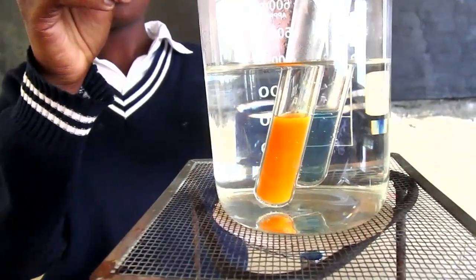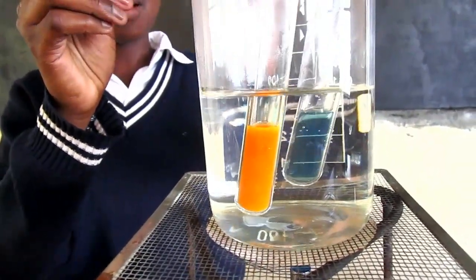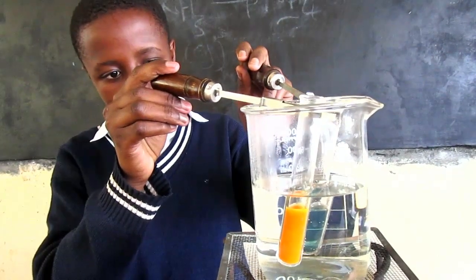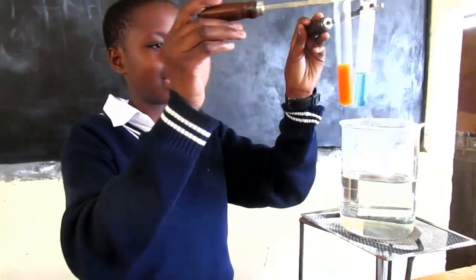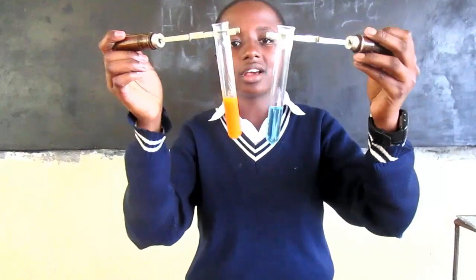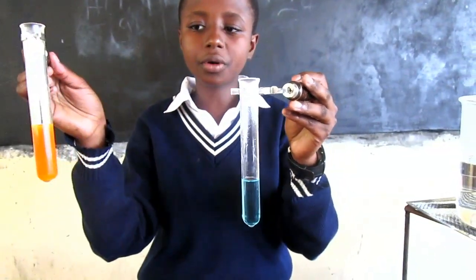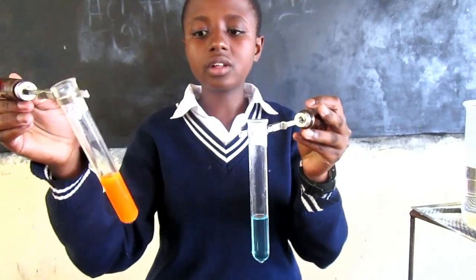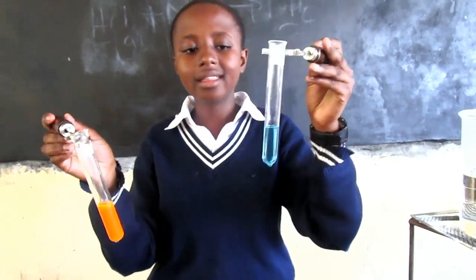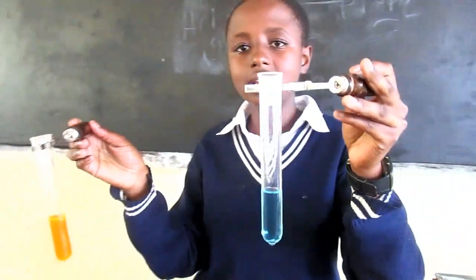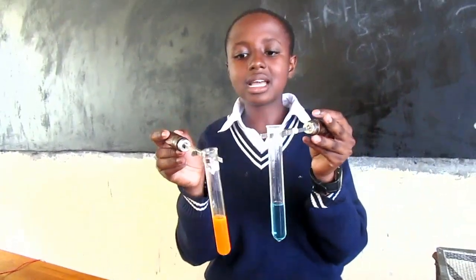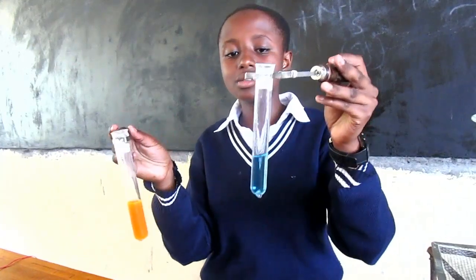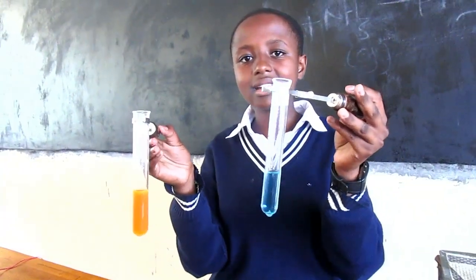As you can see, one sample has changed color while the other has not. The one that changed has gone from blue to green, green to yellow, and yellow to brick red/orange, while the other retained the color of Benedict's solution. This means the first sample contains non-reducing sugar, while the second does not contain non-reducing sugar.